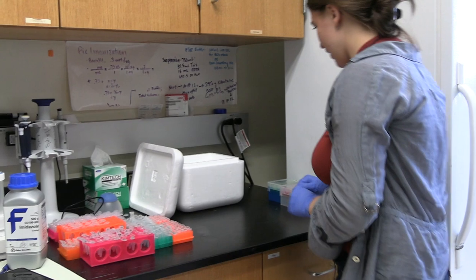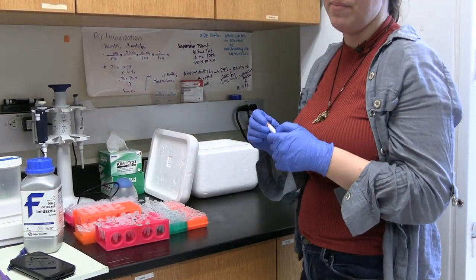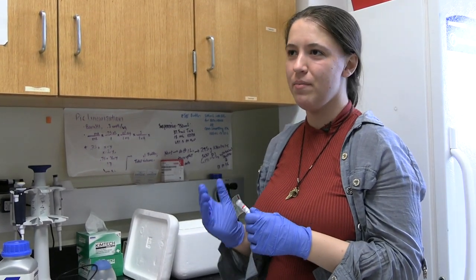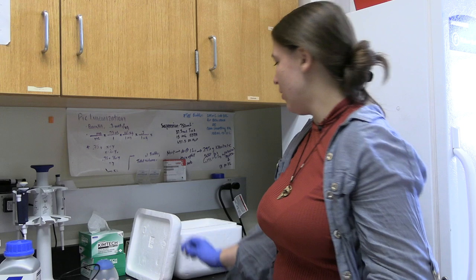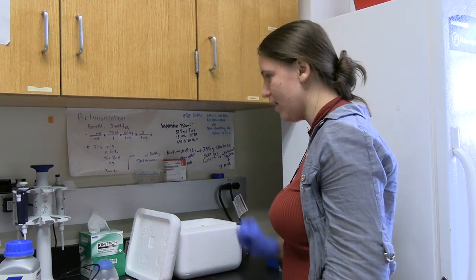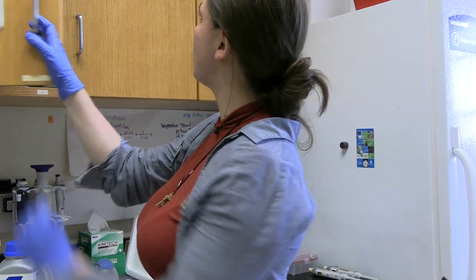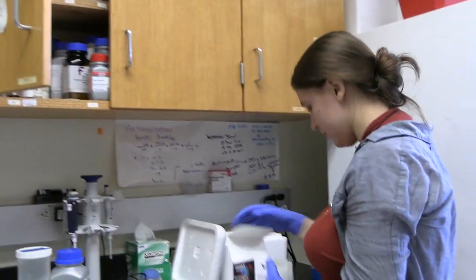Okay. So what I've calculated before is that to make 100 micromolar phalloidin, what I'm going to need to do is add 100 microliters of DMSO to this stock. So I'll keep it on ice for the minute. DMSO, it's stored at room temperature. Kept in the dark.